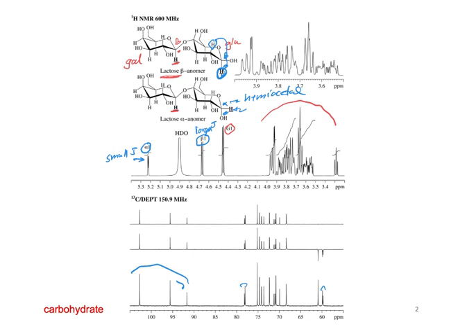What is G1 in the upper one? G1 is this proton here. It's the same for all of them. Yeah, so those are both the same. That's what I was saying, because it's far enough away that it's not affected by those ones.